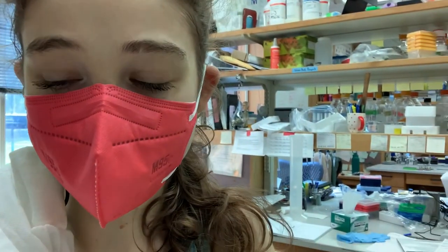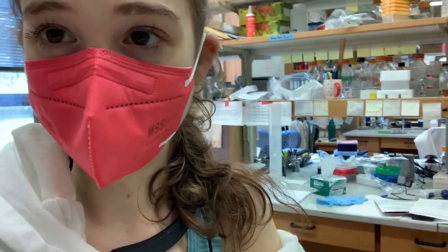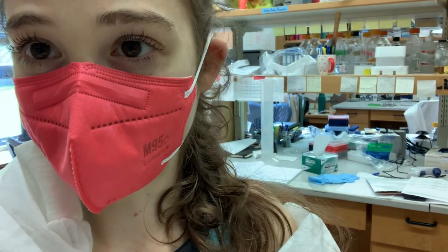So I hope that helps you, and have fun running your PAGE gels. They're probably a lot more fun on your first ones than on the 739th — well, actually the first ones are probably just too scary. But don't be scared. Just make sure you put red to red and black to black, and yeah, have fun!